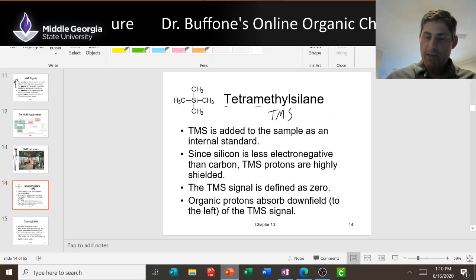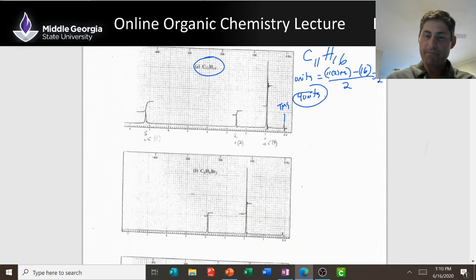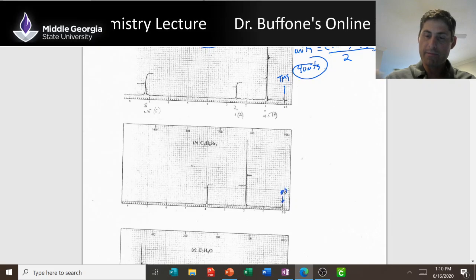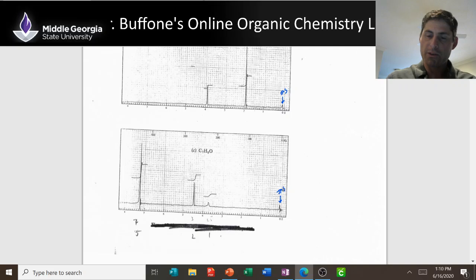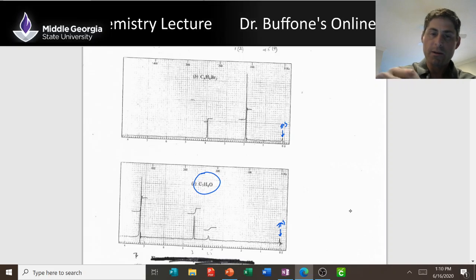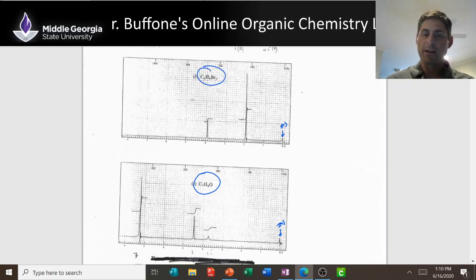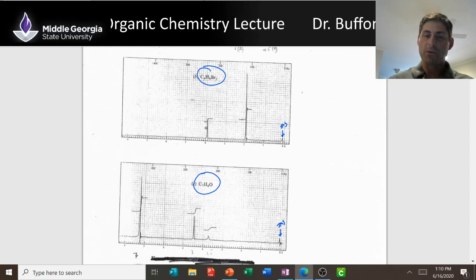So on some of these, you're going to see TMS. See that? Now look at this. There's a little TMS right here. We're just going to ignore it. In other words, it's not part of our, in this case, C7H8O or C4H8Br2. It's just an internal standard that we've added in addition to the compound that gives us these signals.